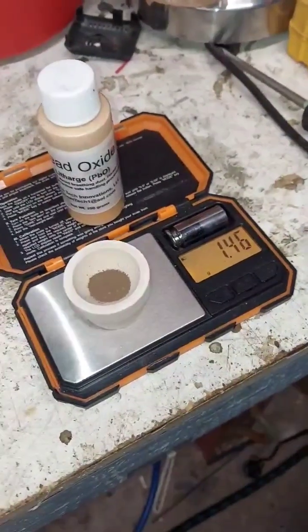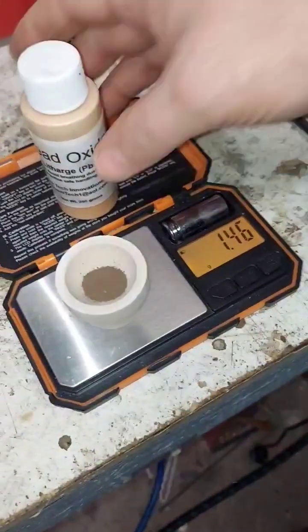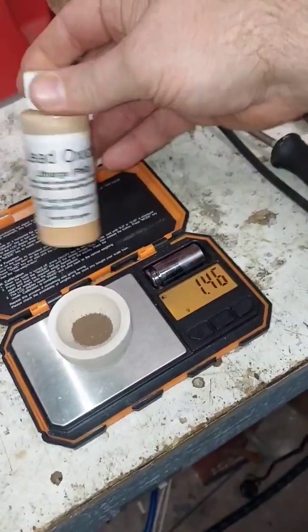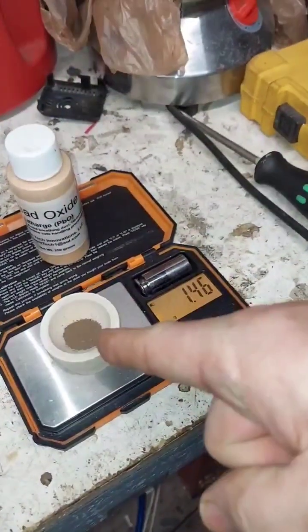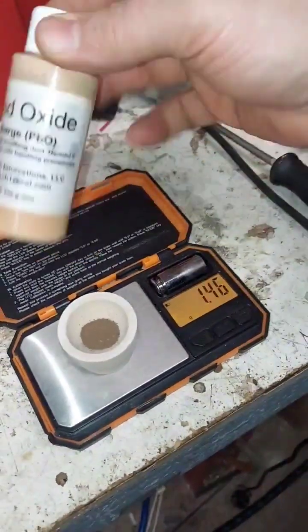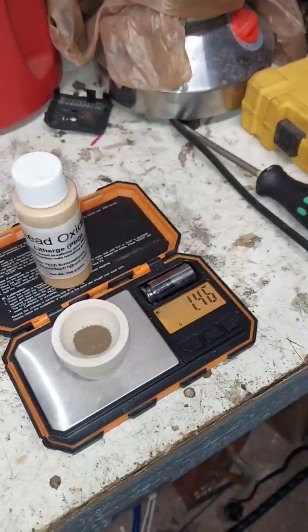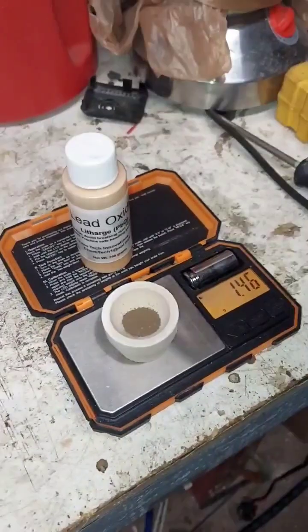We have 1.46 grams of dirty gold that we're going to purify to three nines fine using a cupel and some lead oxide. The base metals and impurities will go into the cupel and be carried away by the lead oxide, and what's left over is hopefully close to two nines fine.